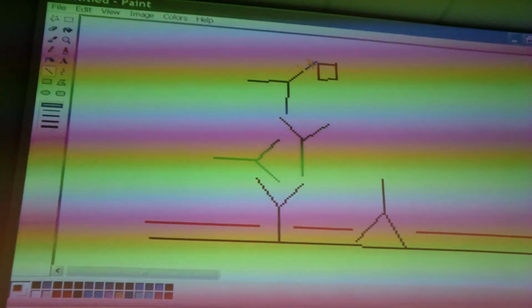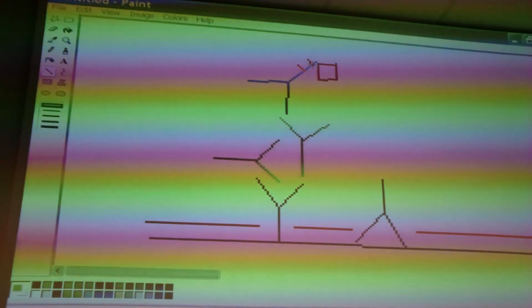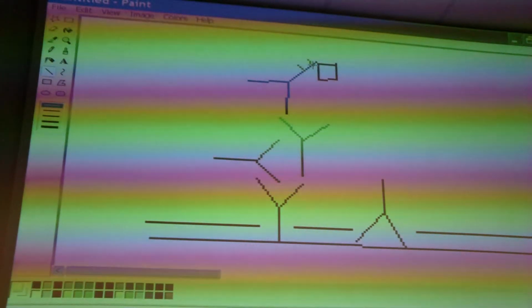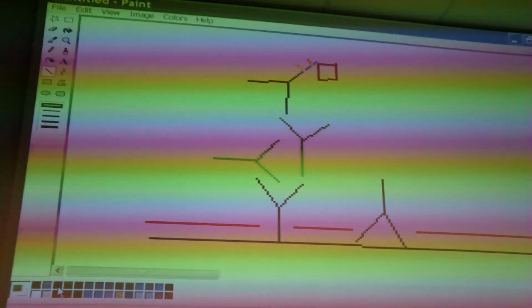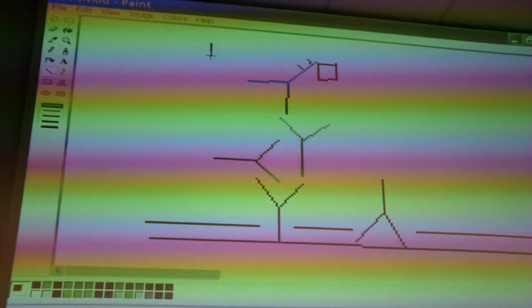And how do you get the peroxidase to bind to the biotin? Well, you have it via the streptavidin. You put it on a streptavidin. Yeah, I'll show you the trick. It's actually the same trick. You can biotinylate all kinds of proteins, including antibodies. And you can also biotinylate the peroxidase. Typically, that's what you do. So imagine this was the peroxidase.